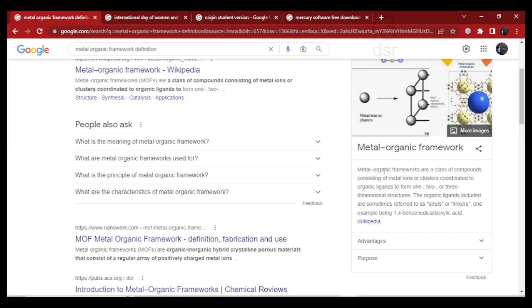Unlike metal oxides or other crystalline materials where powder XRD is used for analyzing, in the case of MOF, it is the first necessary analysis in which a researcher or a student confirms what type of MOF someone has synthesized. So in today's video, I'll be talking about this.